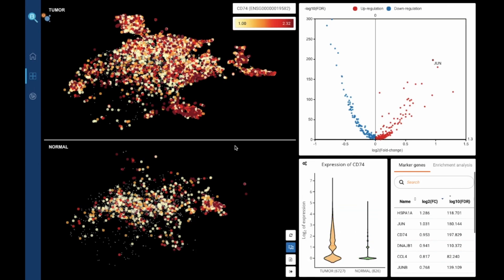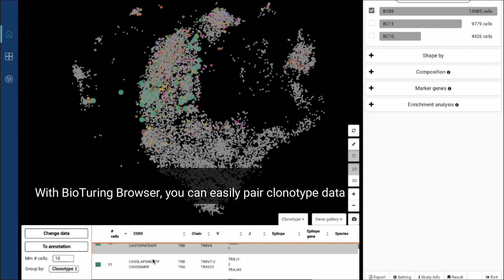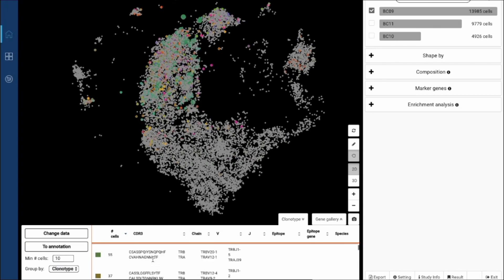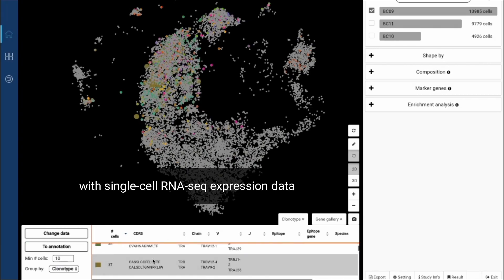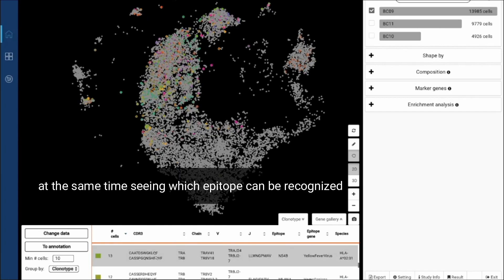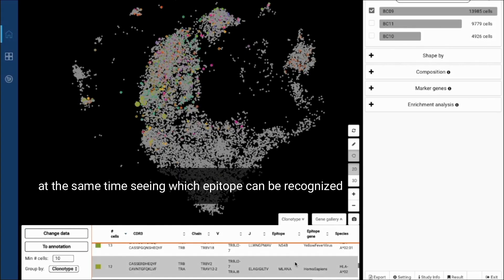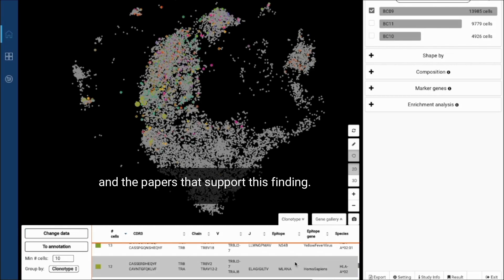Pair clonotype data with expression data. With BioTuring Browser, you can easily pair clonotype data with single cell RNA-seq expression data, at the same time seeing which epitope can be recognized and the papers that support this finding.